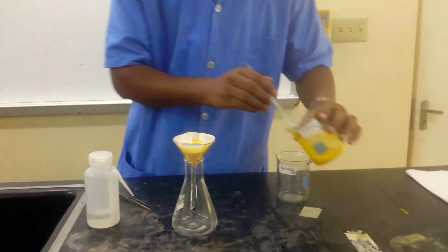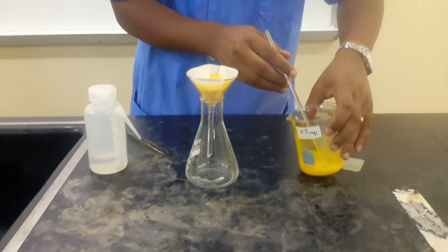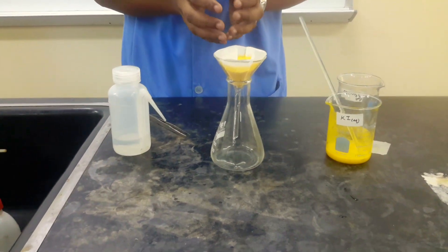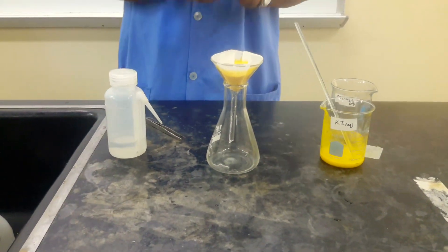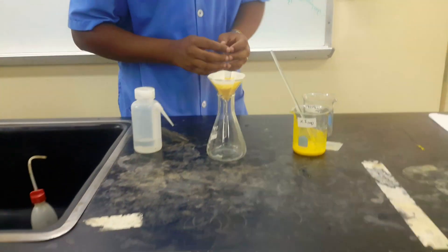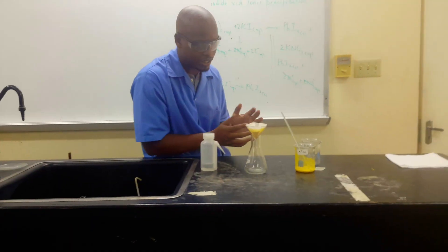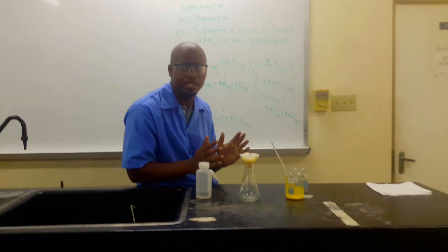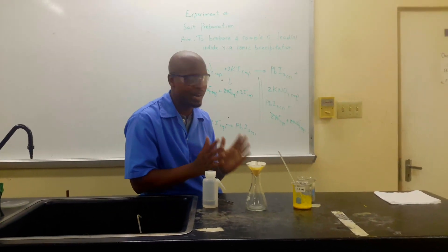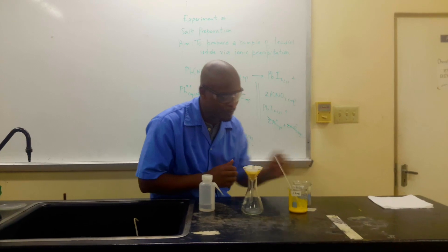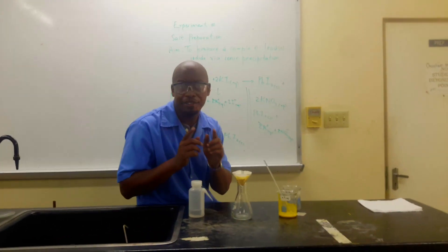So our filtrate based on our equation is potassium nitrate going through. And then our yellow solid that remains in the filter paper as the residue is our lead iodide. So we'll just wait on this and we'll come back a little later when we're finished to just pat it dry. We'll just put it in a paper towel.